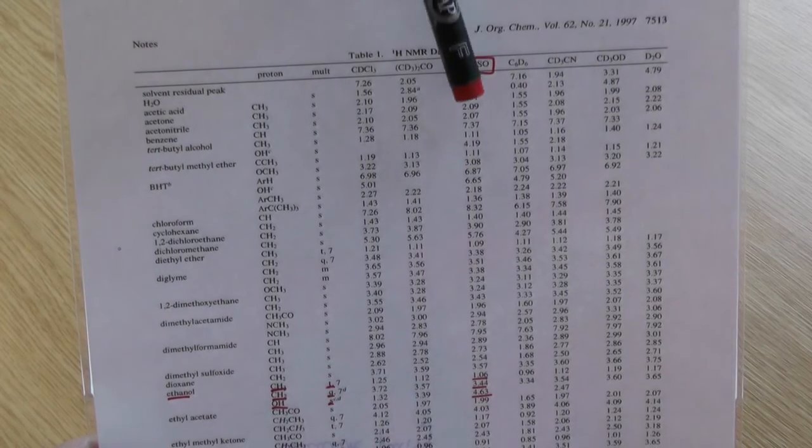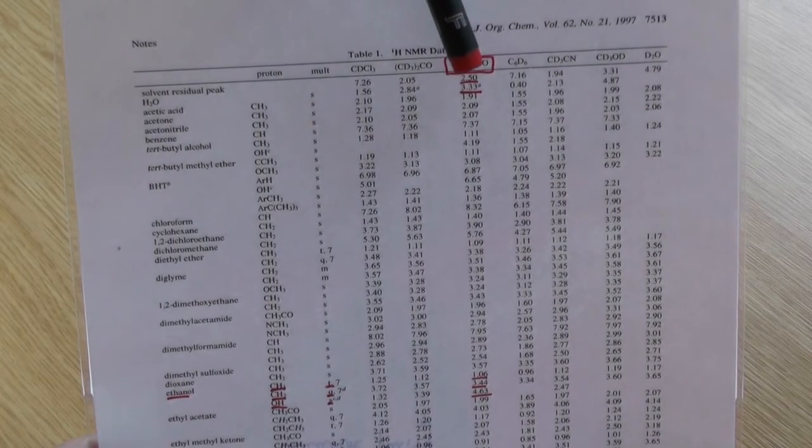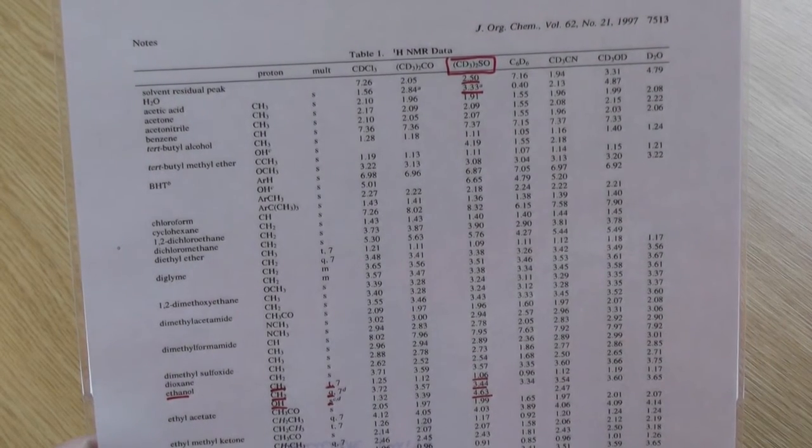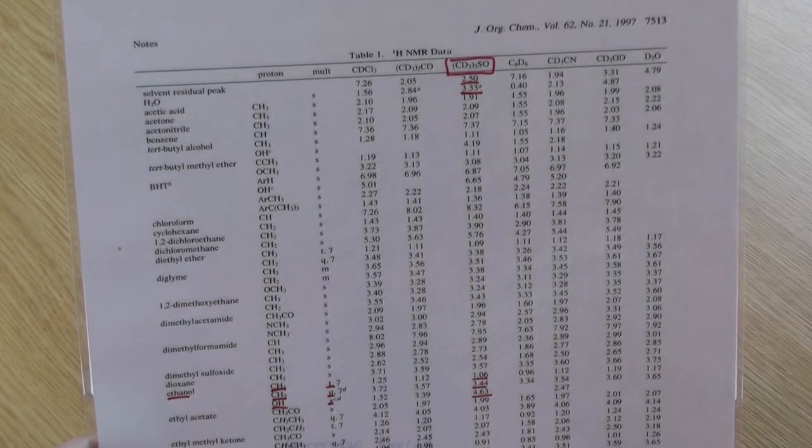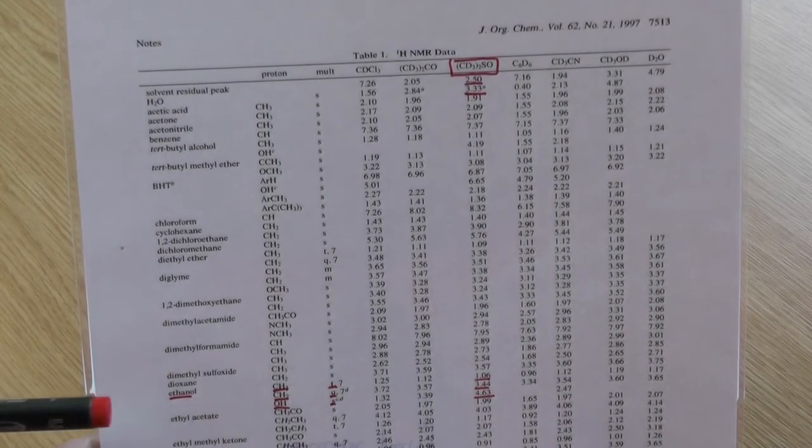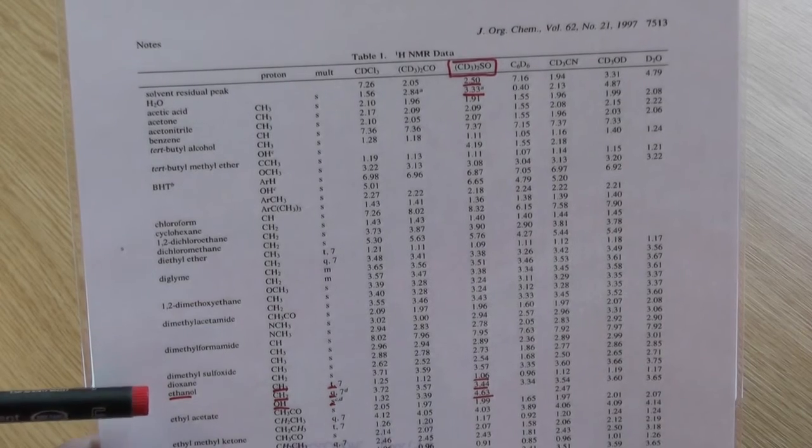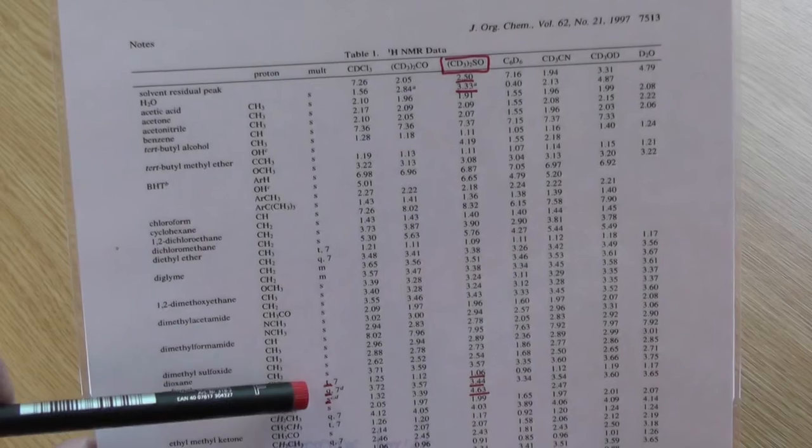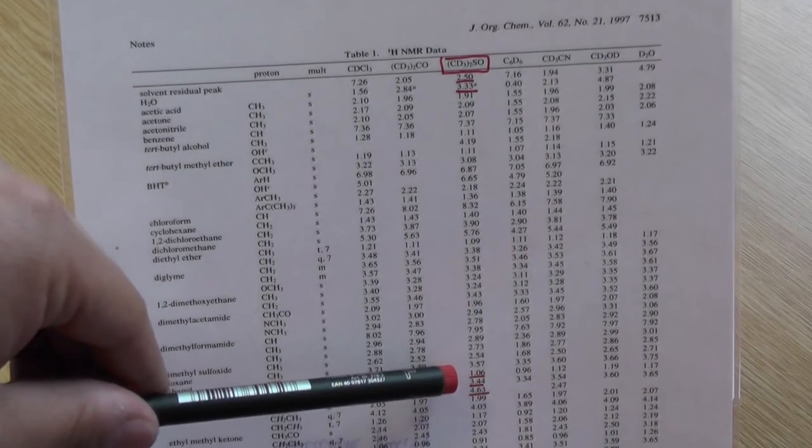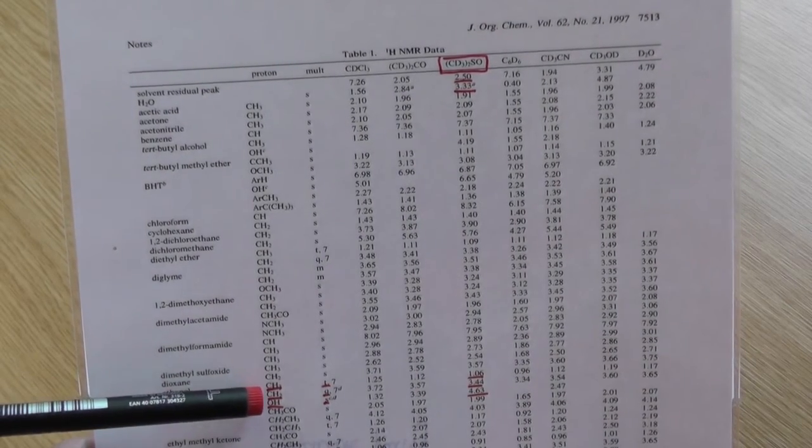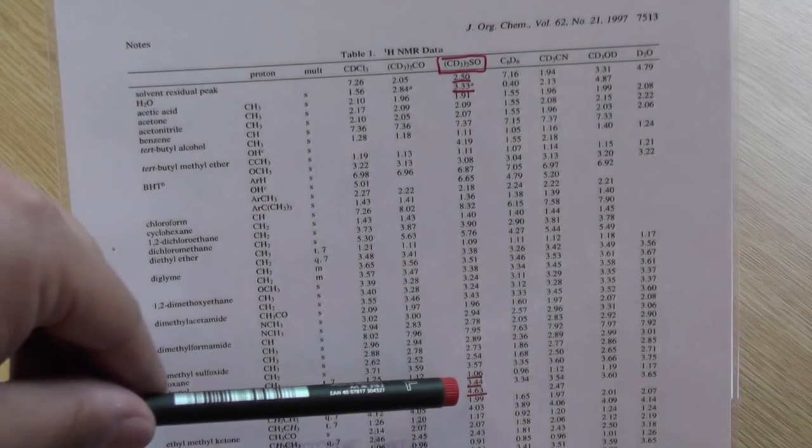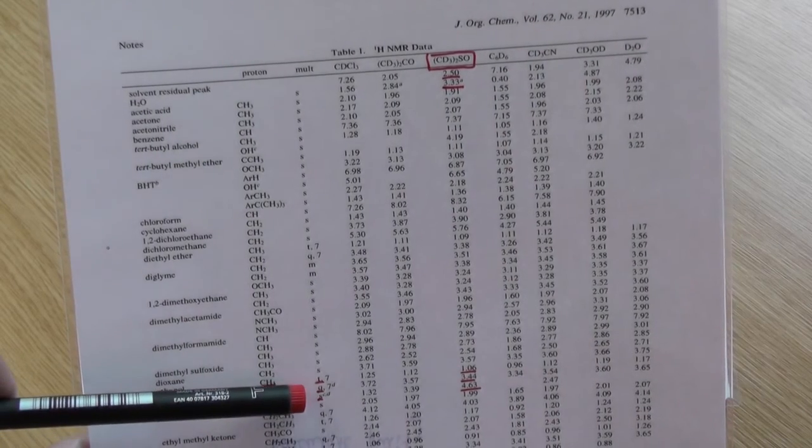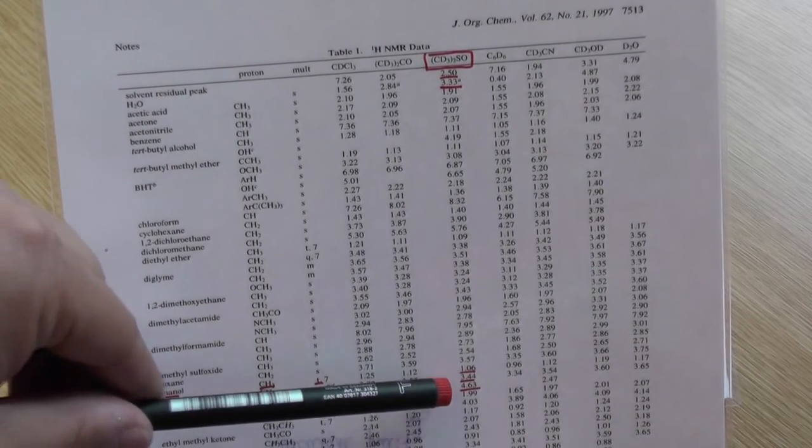So you look at the two chemical shifts, one from the solvent and one from water, and you can rule them out from your spectrum. We also did our reaction in ethanol. Looking at where ethanol is in the table, you can see that the CH3 of ethanol should give a triplet with a chemical shift of 1.06. The CH2 group should give a quartet at 3.44 and the OH group should give a singlet at 4.63.